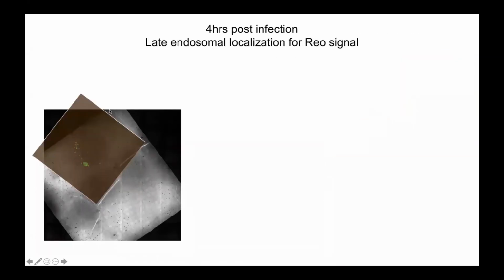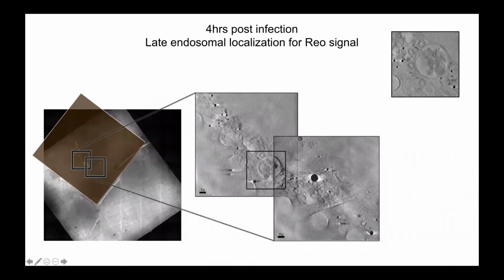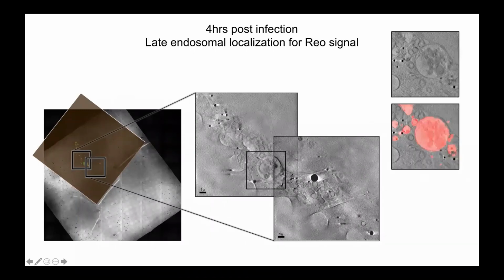Now that we have the fluorescent data in the right orientation, we can take the data that we collected in X-rays. So we collected 2 areas here, and you can see them here, next to a nucleus, and with quite a few vesicles and a pretty substantial, respectable multivesicular body or late endosome. Now, if we focus on this, you can see the outside membrane, quite a lot of wrapping of membranes and other components here. It was red, so the correlation allows us to immediately point to it as a leaky vesicle, so its membrane must have at some point opened up.